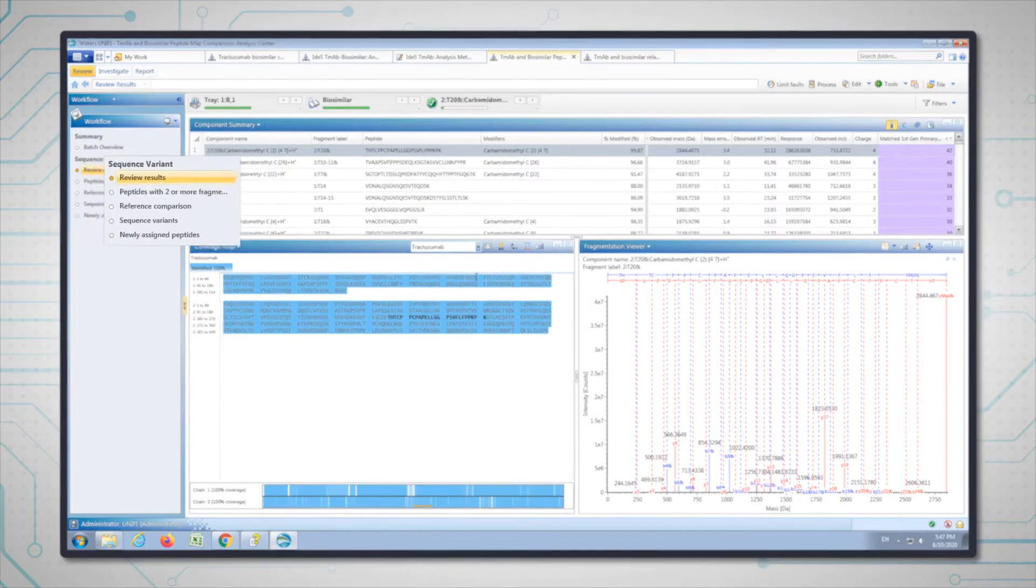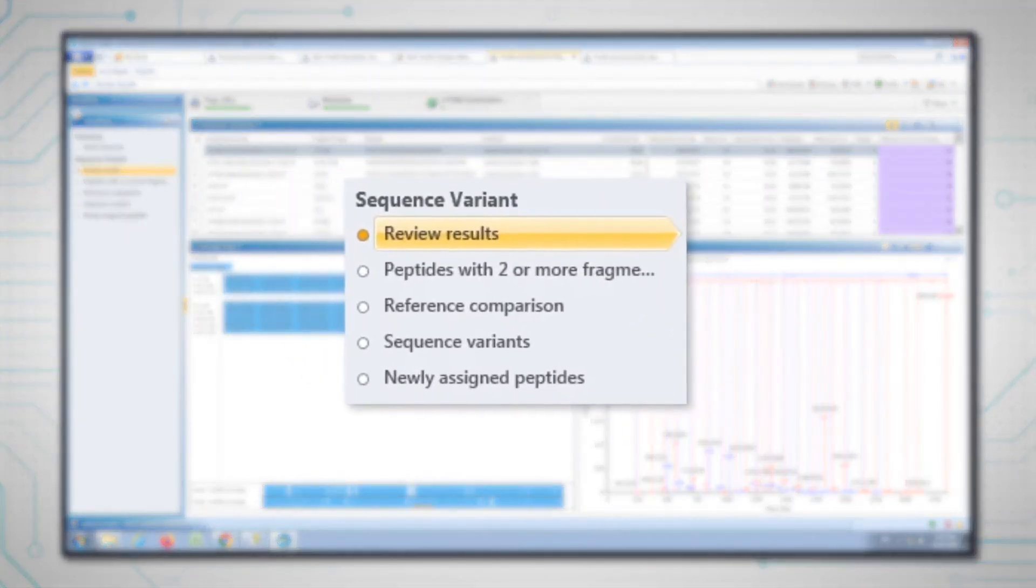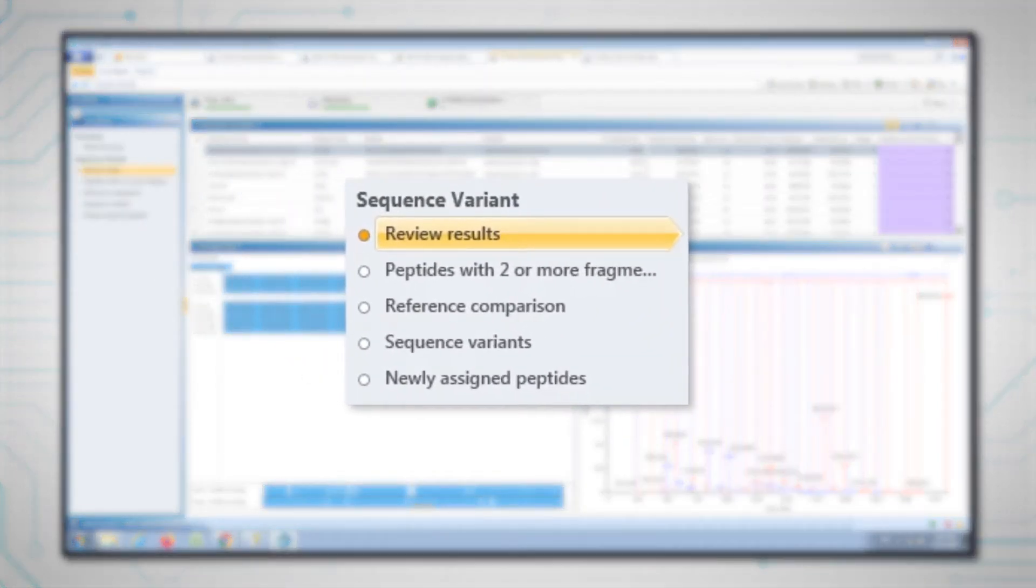For the peptide map analysis, I've made a sequence variant workflow in Unify which allows us to look at the data from both the trastuzumab and the biosimilar digests.